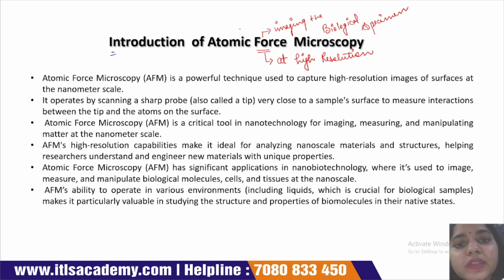If we want to see nanoscale structures, then we can easily visualize the nanostructure with the help of this atomic force microscopy.